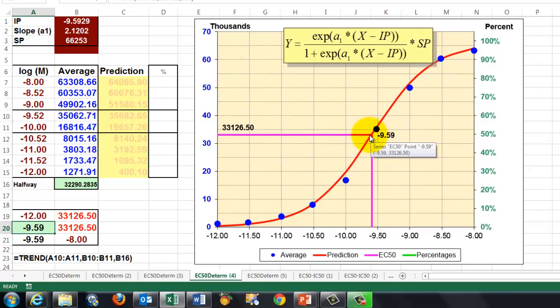If you want to make that insert, you need 3 sets of coordinates. This set of coordinates, that set of coordinates, and that set of coordinates. I put those sets here. The first one is very simple, the first cell, that is the highest value, or the lowest, and that one is the opposite one. The real problem is this one. It's not really a problem if you know what to do. That is the value that corresponds with 32,290. Correct?